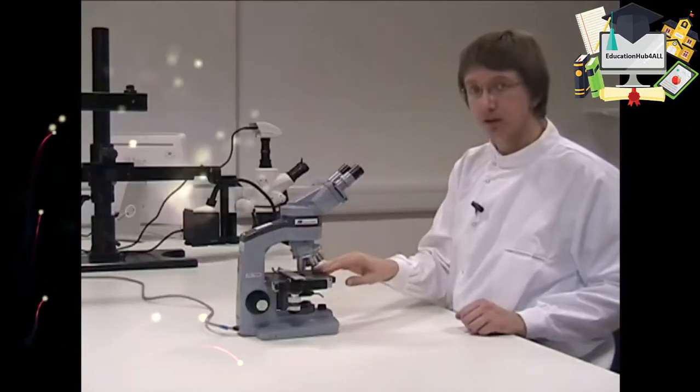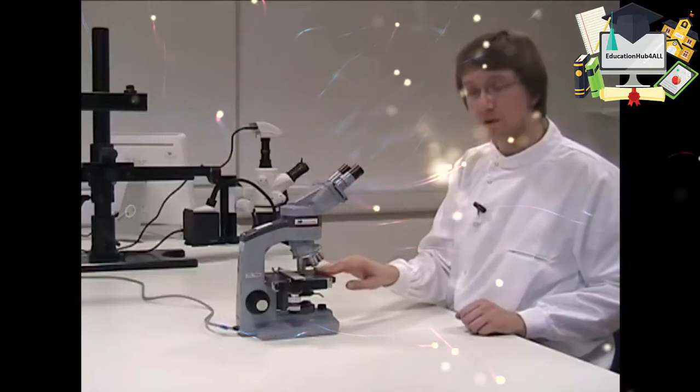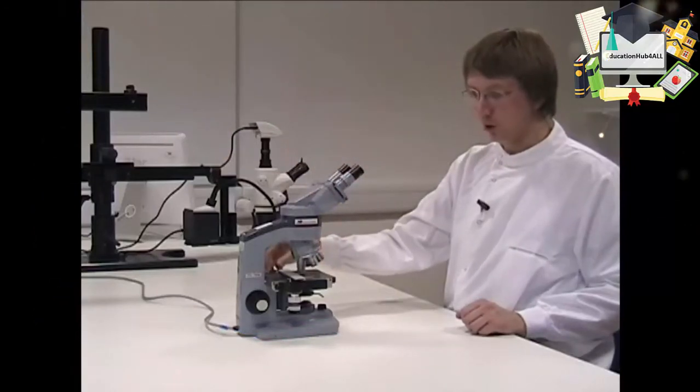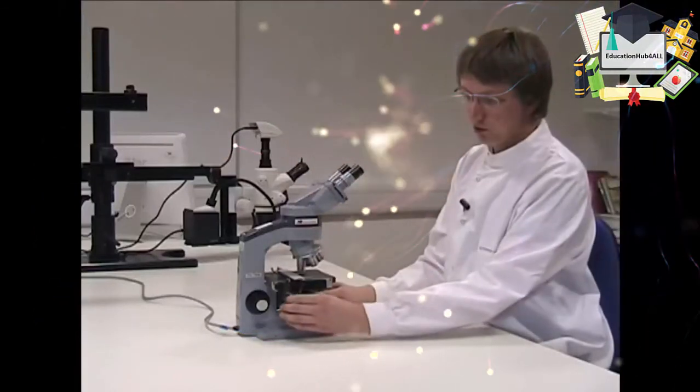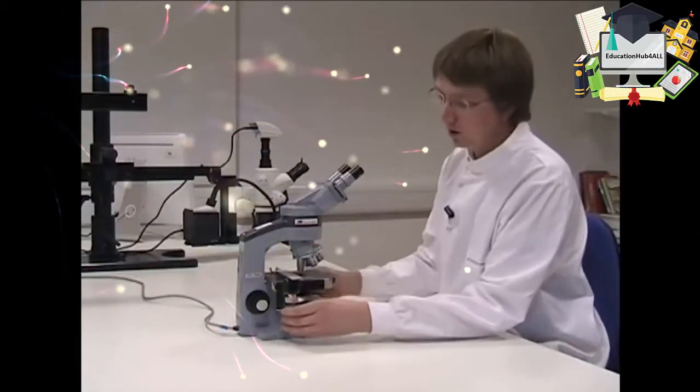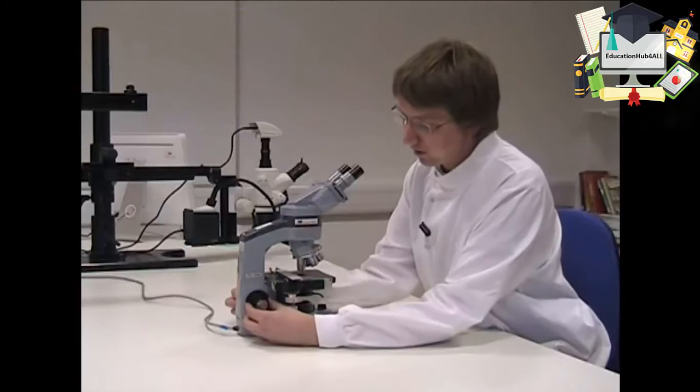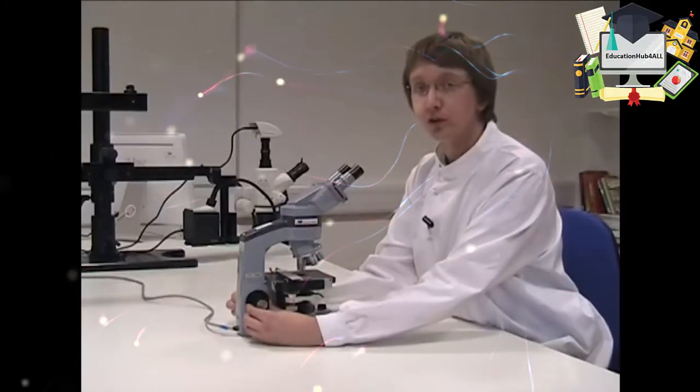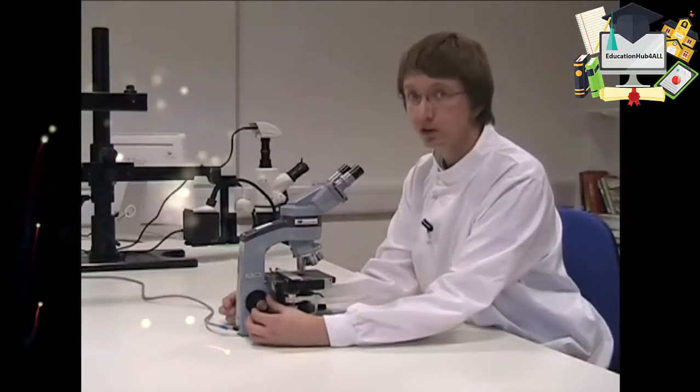Underneath the objectives is the stage where you put your slide. There's a slide holder here. The stage controls are at the side here which move the slide around the stage. At the back of the microscope there are the focusing controls. There's coarse focus and also a fine focus control.